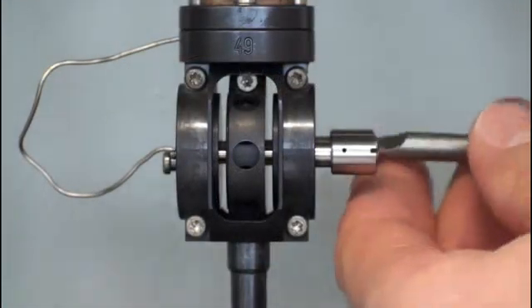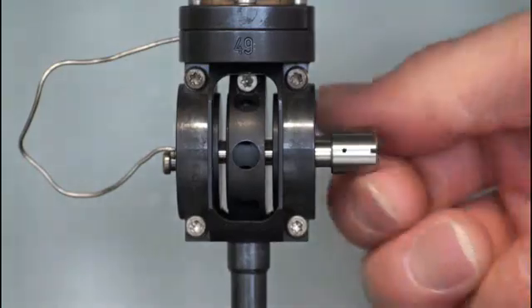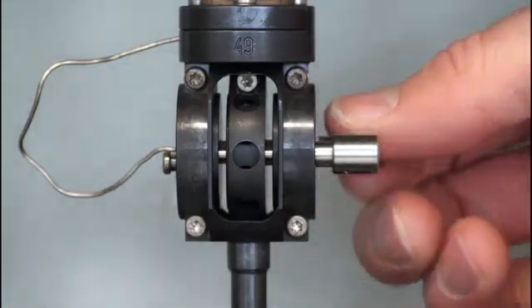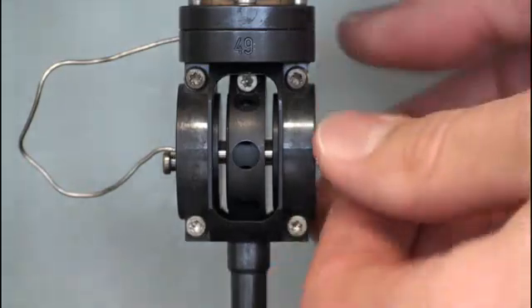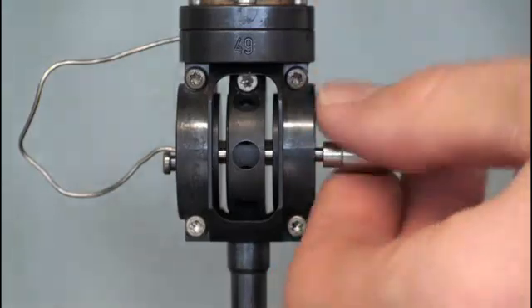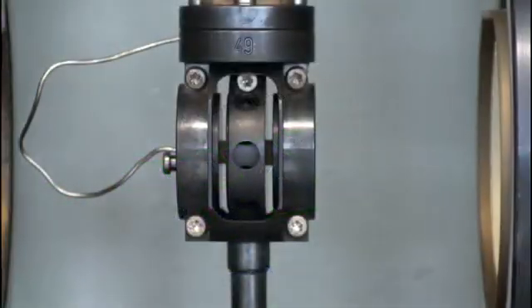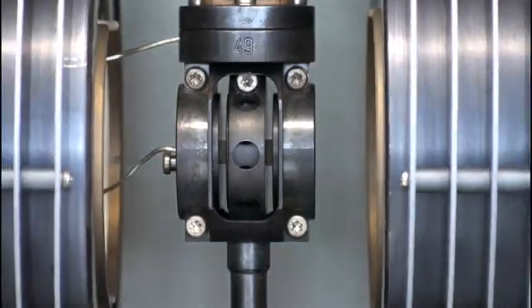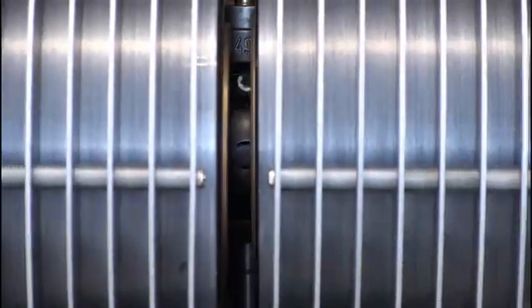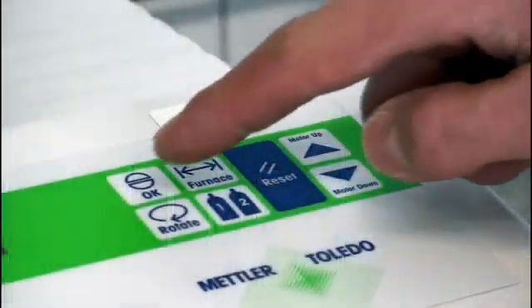Before we can close the furnace we have to remove these two screws. Let's start the measurement.